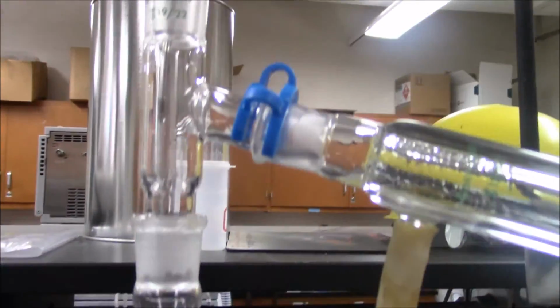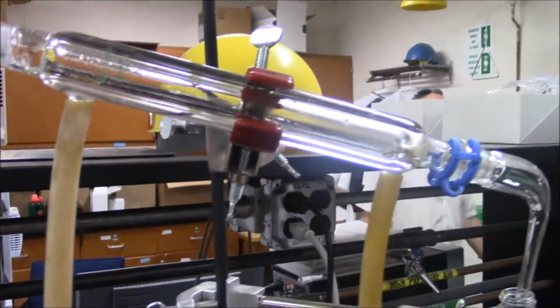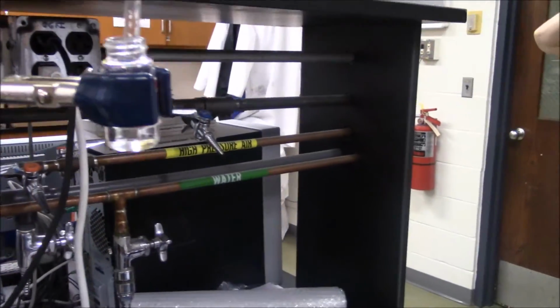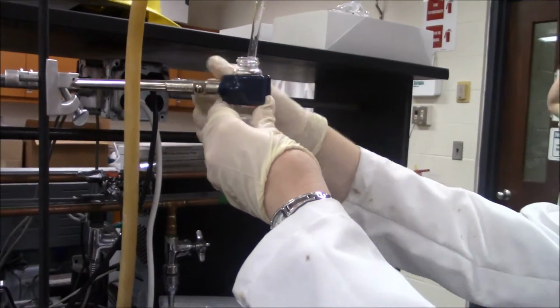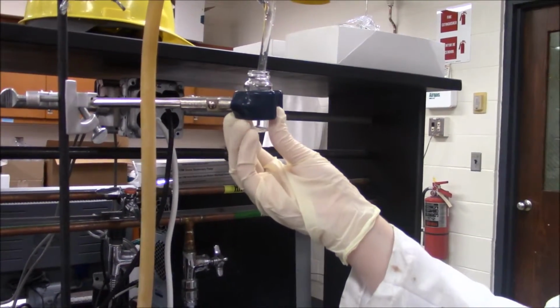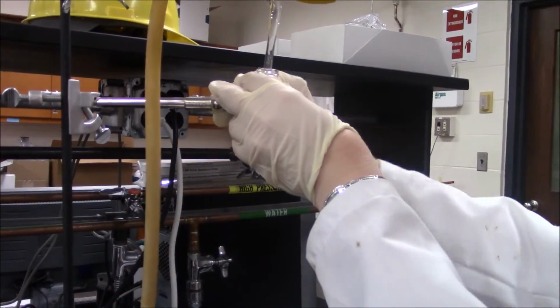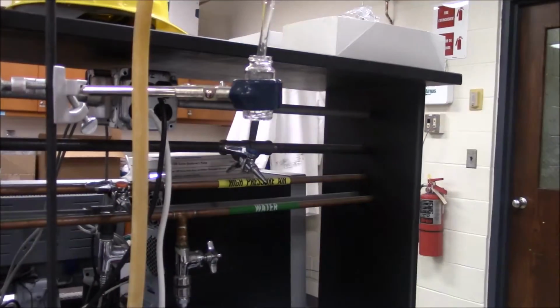The temperature of the top digital thermometer should gradually increase, and distillation should be stopped once it reaches 98 to 100 degrees Celsius. At this point, the vapor is almost entirely water because most of the ethanol has already been separated and collected. Vapor ethanol concentration can be estimated using temperature data and the vapor-liquid equilibrium curve. These estimates can be verified with density measurements, which will be done at the end of distillation.